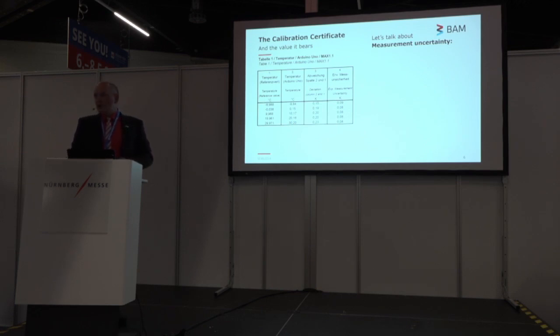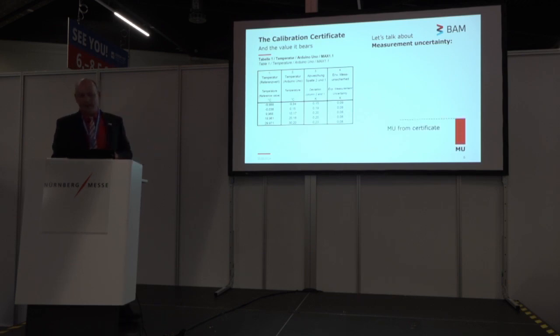And here's another important message. The measurement uncertainty that you are using in the process and that you have to consider in terms of metrological traceability is not simply the measurement uncertainty that is provided here in this table. Further contributions have to be added, as I mentioned before. And the first further contribution is just in the column on the left side, it's the deviation.